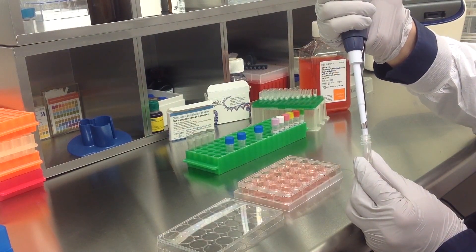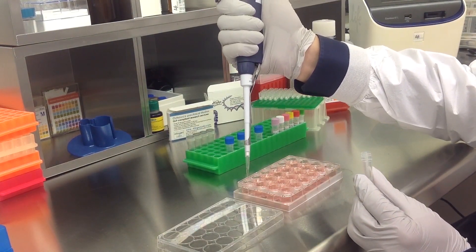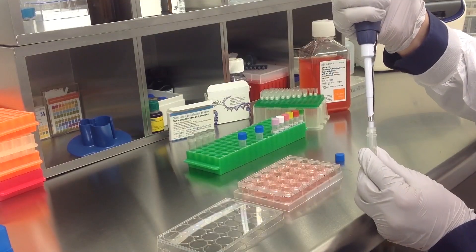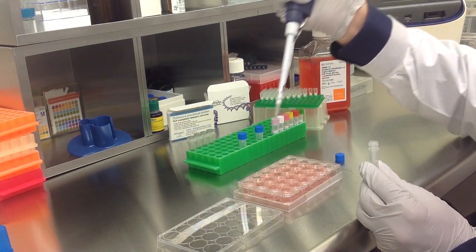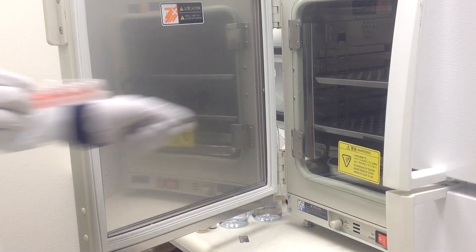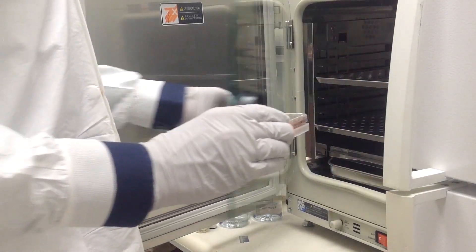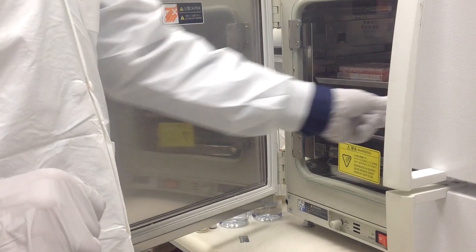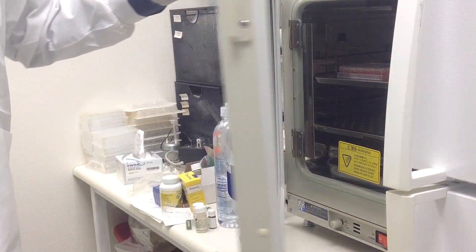Add the prepared transfection complexes to the 500 microliters of complete growth medium. Once you have treated all appropriate samples, incubate the cells at 37 degrees Celsius in a humidified carbon dioxide incubator. Assay for phenotype or target gene expression 48 to 72 hours post transfection.